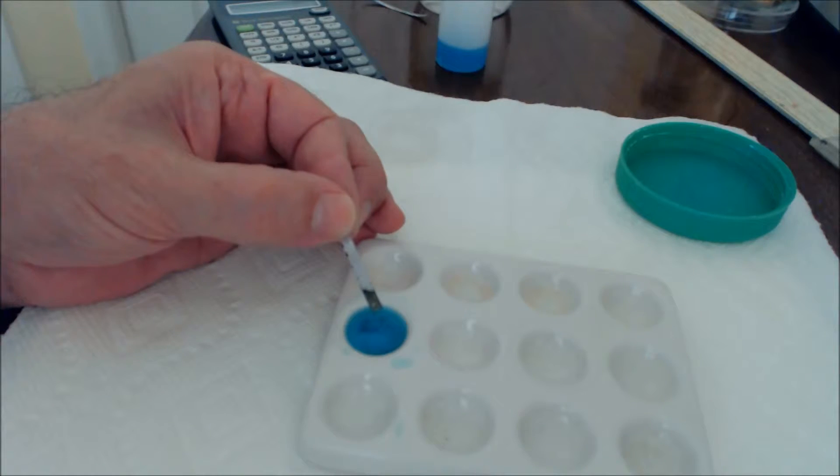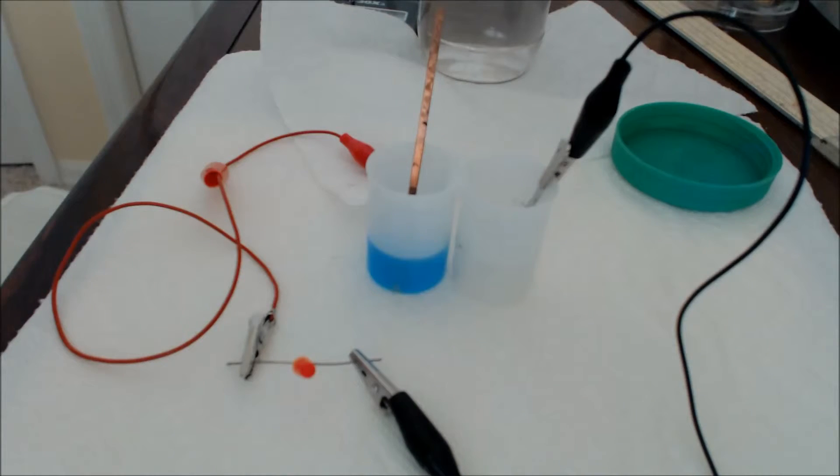And now I'm going to show you how you can exploit this reaction to produce electricity in a wire through an electrochemical cell. As we saw previously, when you take magnesium metal and put it in a solution containing copper ions, such as copper sulfate, the magnesium metal gets oxidized and the copper ions get reduced. So an oxidation reduction reaction.